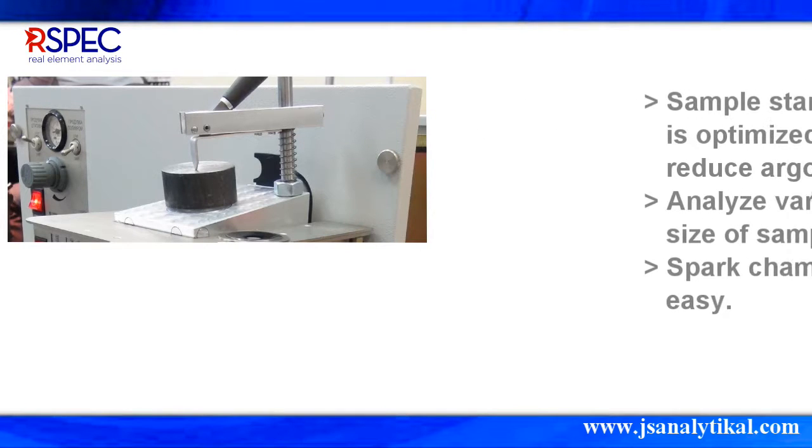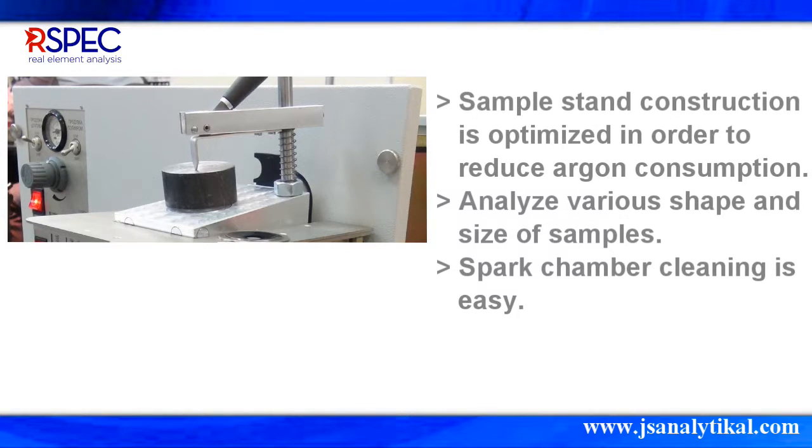The sample stand construction is optimized to reduce argon consumption. The absence of the upper housing and sample clamp mechanism makes analysis easier for samples with various shapes and sizes. The spark chamber is easy to clean and does not need to be disassembled. Its closed-cycle water cooling system eliminates any form of heat from the sample stand.